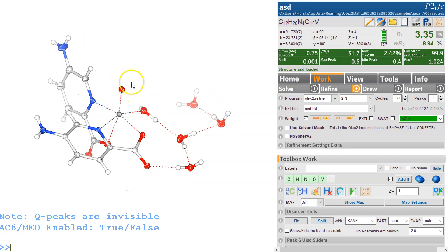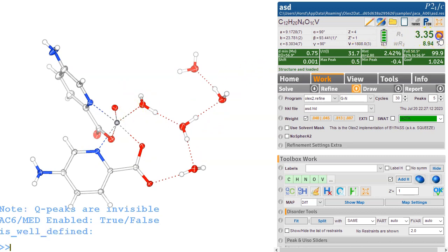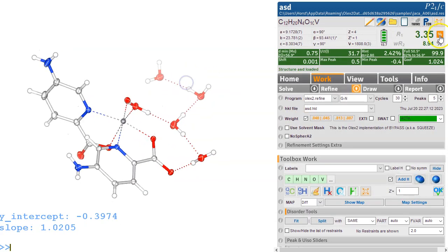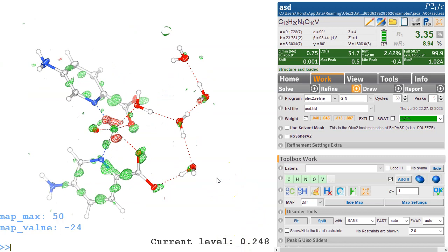Okay, one question is, why is there no hydrogens on this? And that's because that's a vanadium oxygen double bond. It's 1.6, so that's quite a lot shorter than this one to the water molecule, which will be about 2. Yeah. So that looks quite straight. I don't think there's any extinction here. There's no outliers either, so I'm not quite sure why we're seeing a little bit of residuals that look a little bit smudgy here. However, the level is very, very low. It's only 0.25, so it's not a lot.